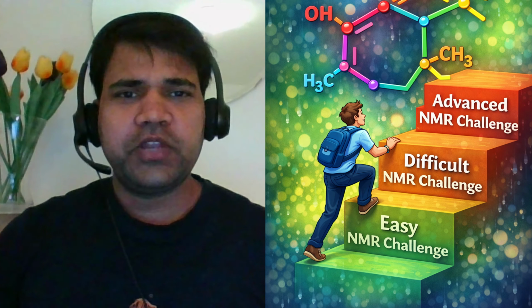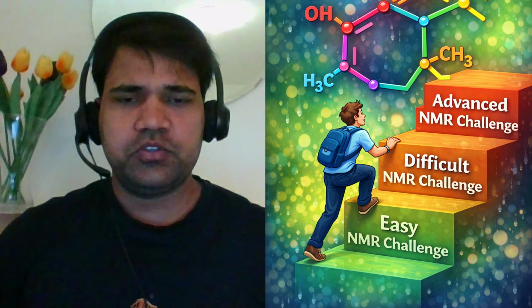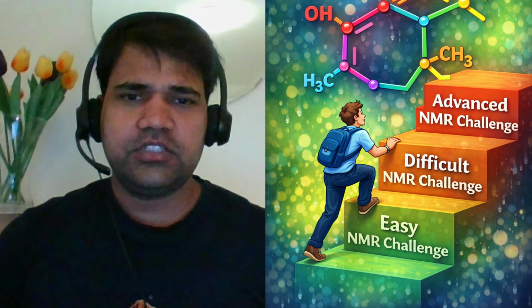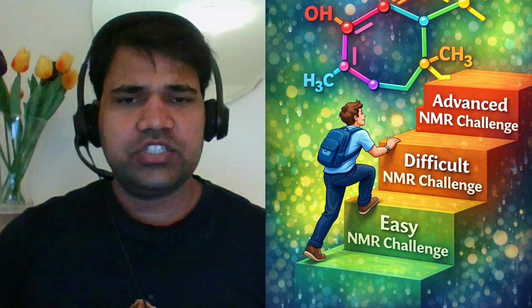If you want to master your NMR problem solving skills, then you are in the right place. Welcome to the NMR Challenge series, where each video presents a new NMR spectroscopy problem from beginner to advanced level. Here, we systematically analyze 1H and 13C NMR, along with 2D techniques such as COSY, NOESY, HSQC, and HMBC, depending upon the problem, to uncover organic structures step by step.